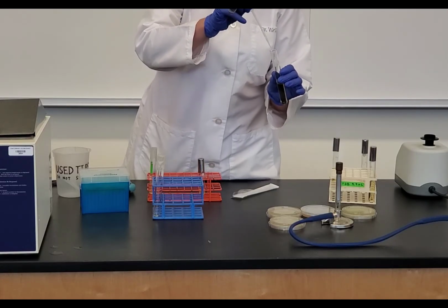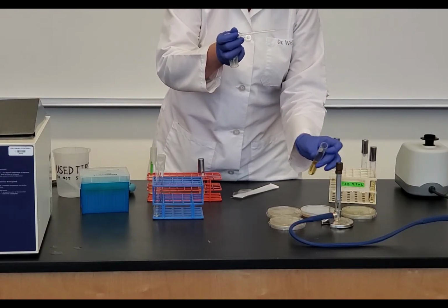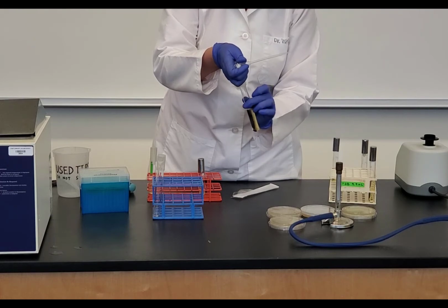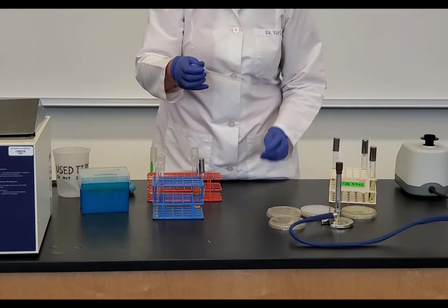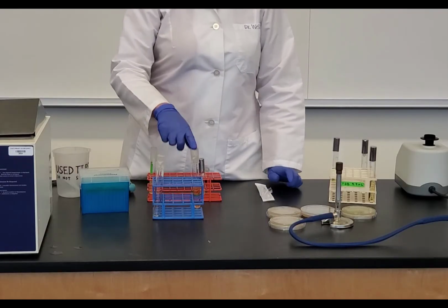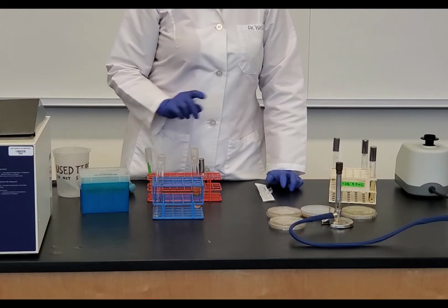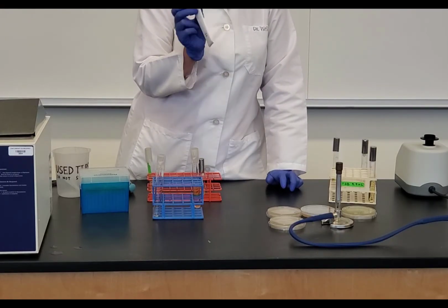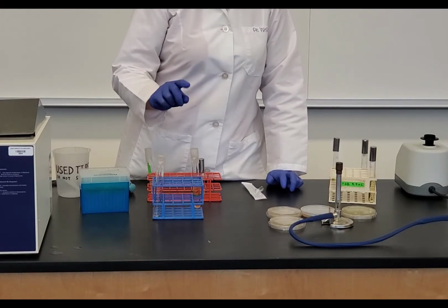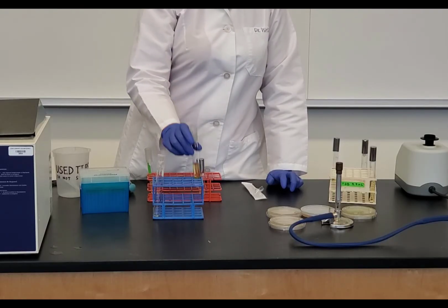And I want to make sure not to touch the transfer pipette to the tube that has the virus. So flame it, put the cap back on. Then I'm going to put this back in here. If I touch this to the tube that has the virus, now this E. coli stock is going to be contaminated. So take care when you're transferring with your transfer pipette. Make sure not to touch the contents of the tube when you go to add it to this tube.